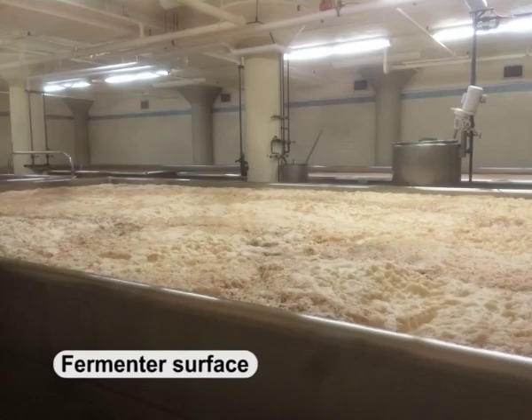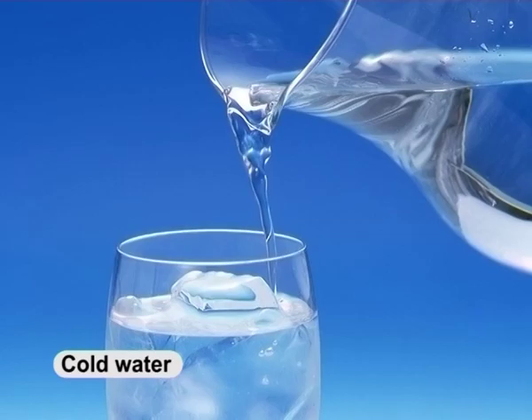In case of larger fermenters, beyond a certain size, excess heat is generated and the fermenter surface becomes inadequate for heat removal. The size at which fermenter surface becomes inadequate for heat removal will depend on the fermentation process and the ambient temperature at which fermentation is being carried out. In such cases, internal coils have to be used to circulate cold water through them for removing the excess heat.